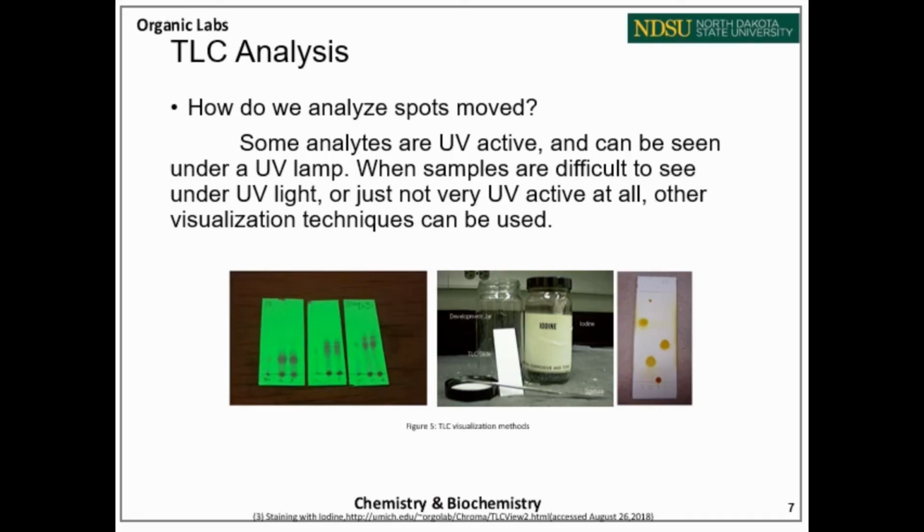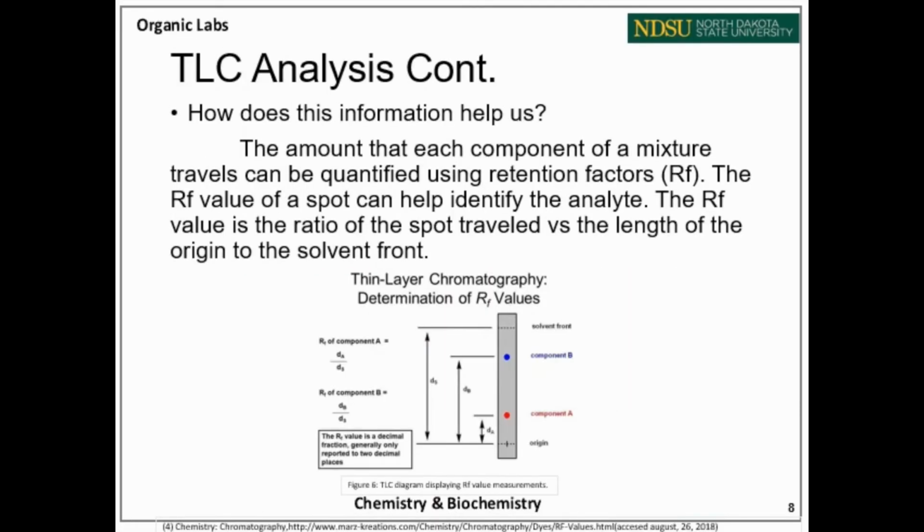You will see these spots turn yellow like the picture on the far right, and you may even be able to see spots that you weren't able to see under the UV lamp. So now that we've visualized the spots, we can extract information from them.